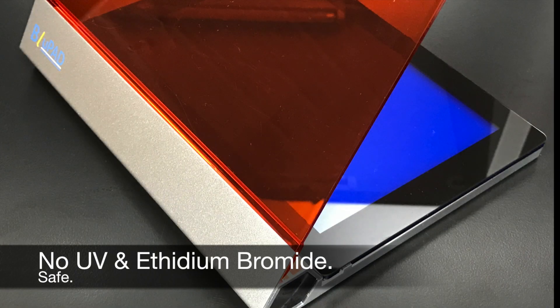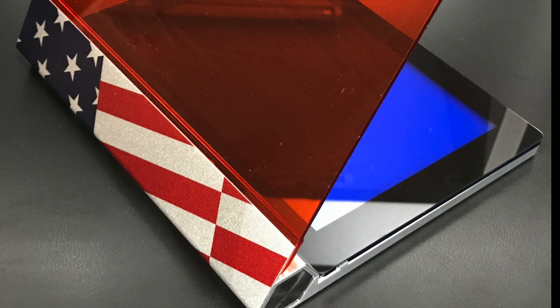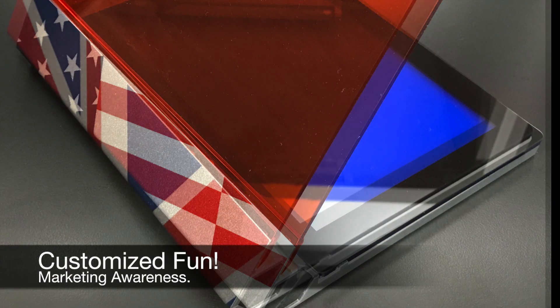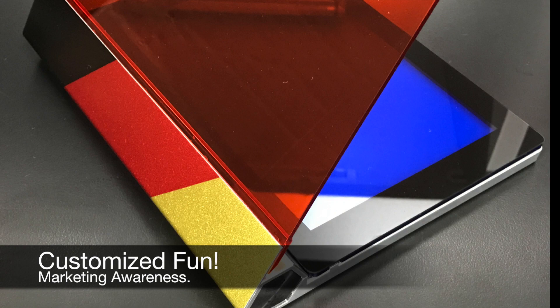For making the lab workplace a much more fun area, the metallic area of the amber filter can be custom designed with flags of various countries or a system provider's own logo for maximizing the user's awareness.